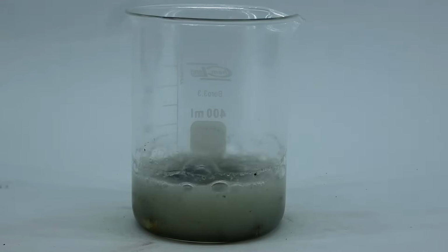This gas is very poisonous, so I had to use my respirator and a fume hood to be safe, but it also has a horrible stench of rotten eggs, which is detectable even in the parts per billion, meaning that literally my whole lab now smells like rotten eggs.